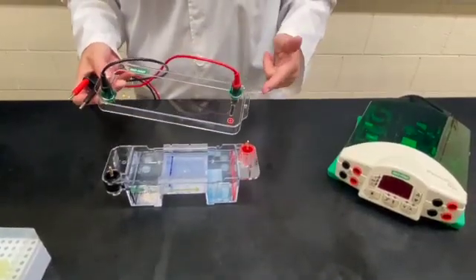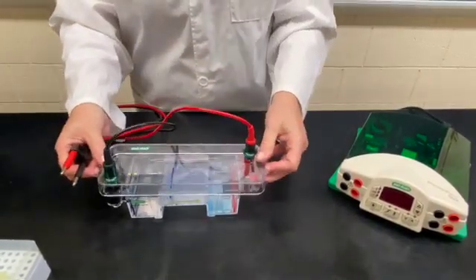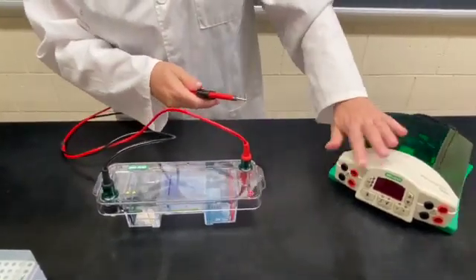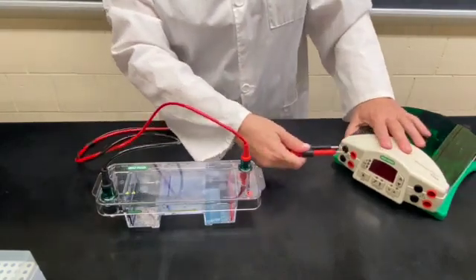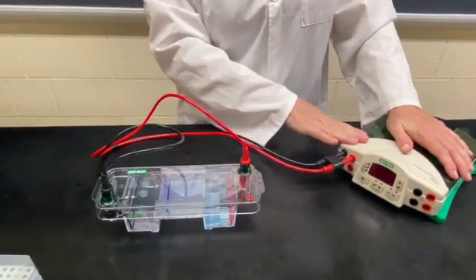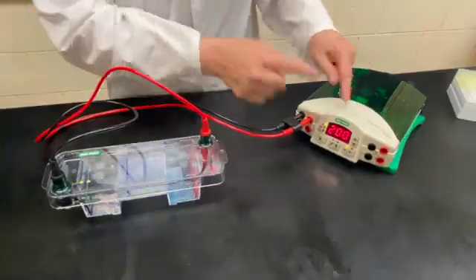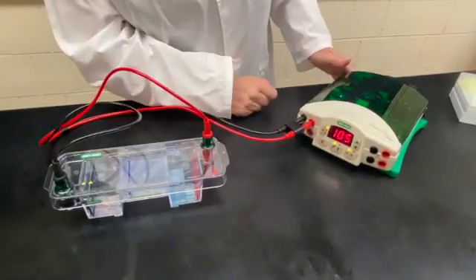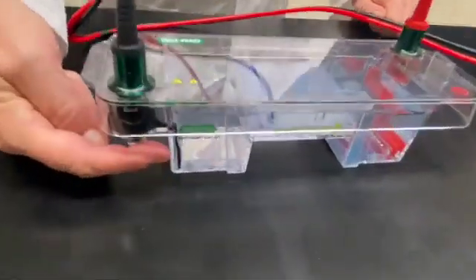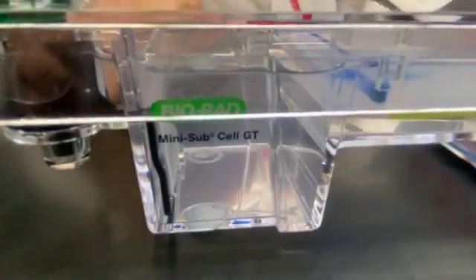The next thing is how to put the lid on the box. We're going to match electrodes red to red and black to black so that the electricity flows in the right direction. Press down firmly, then put the other end of the electrodes into the electric source, again matching red to red and black to black, pressing in firmly. Now we need to turn the electricity on — we've got 200 volts of electricity running through and I've hit the start button. We're going to look for bubbles floating up from the black electrode area to confirm the electricity is flowing through, and it's a success.